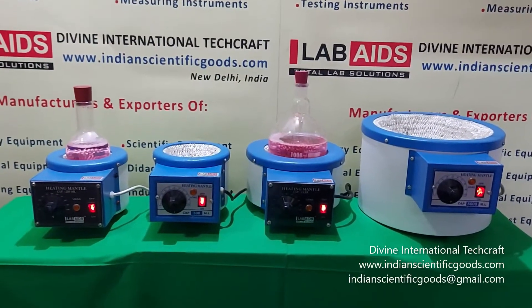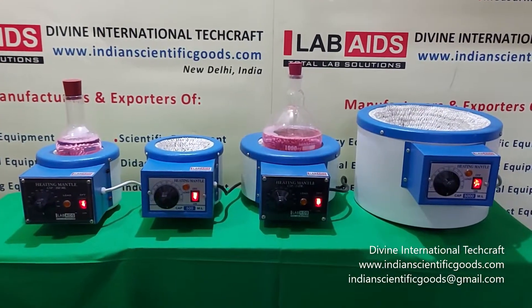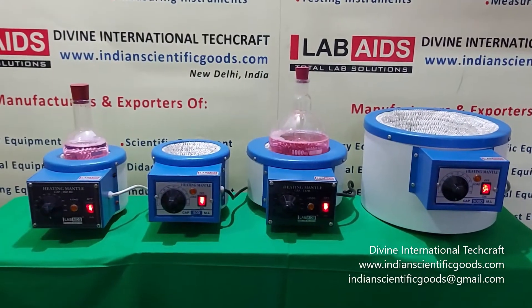Hello, these are the heating mantles or iso-mantles manufactured by Divine International Techcraft, New Delhi, India.